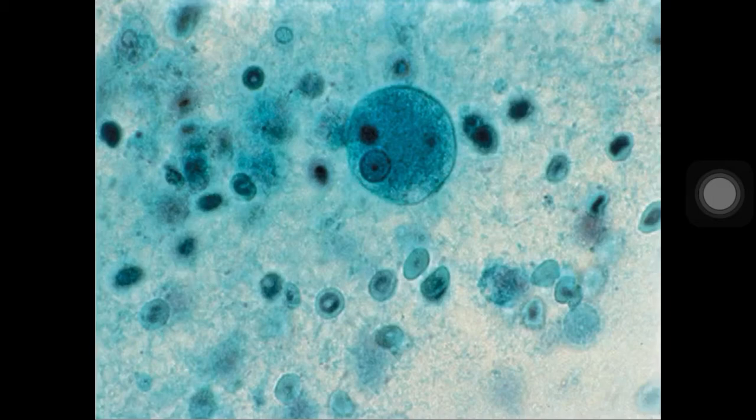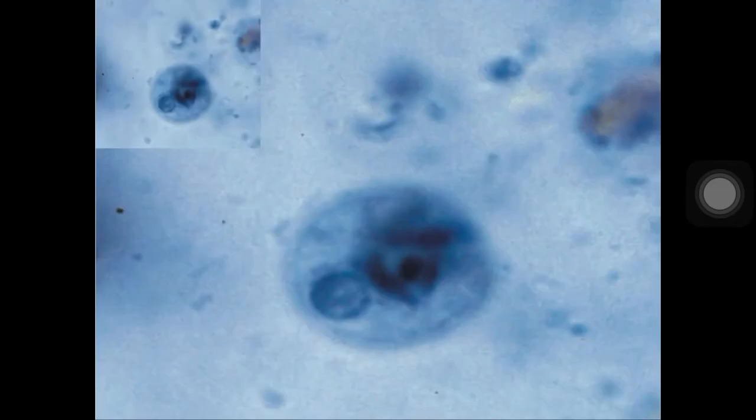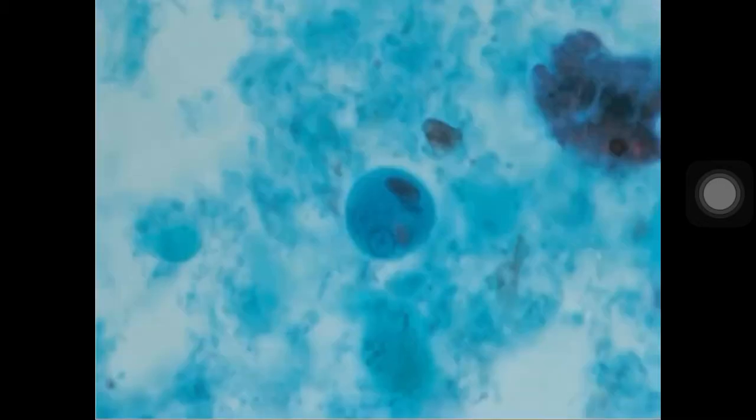Okay. Next, we're done with this, Entamoeba histolytica trophozoite. Second po tayo, for the second set. Next image.